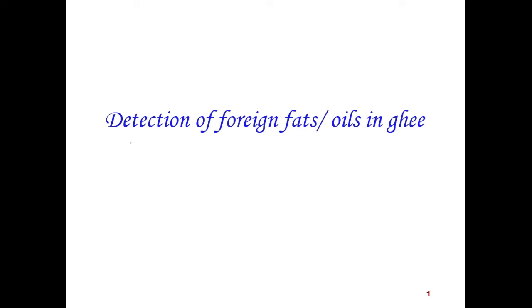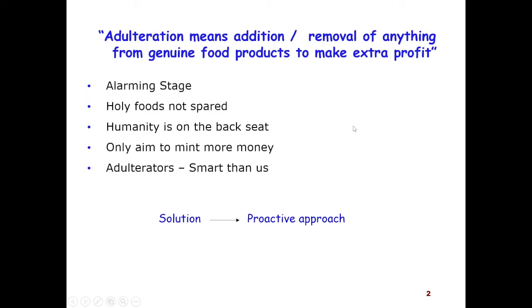Welcome. In this video, we will learn about various methods to detect foreign fats and oils in ghee. Various methods have been developed to detect foreign fats in ghee, and we will learn about them in this video. So first, what do you mean by adulteration?